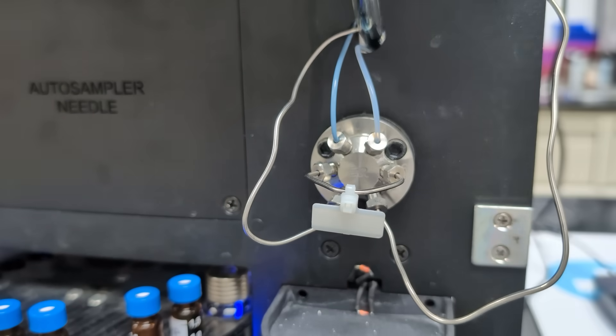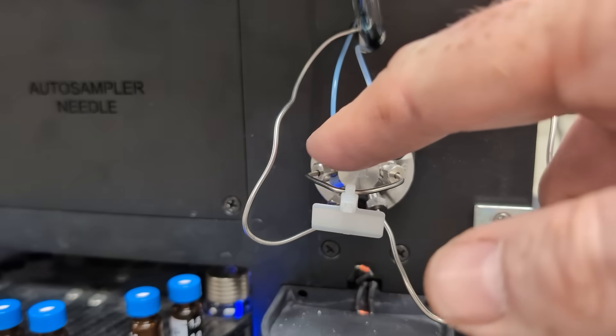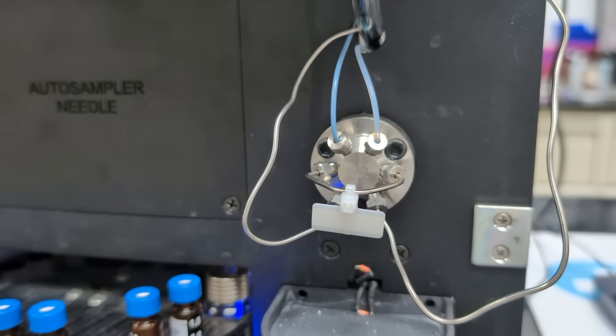And then when that happens, we allow the system to then clean the needle while the run is happening, speeding up our run just by a little bit. So we pre-clean before our next injection. That way you always have a nice clean needle and clean sample loop.